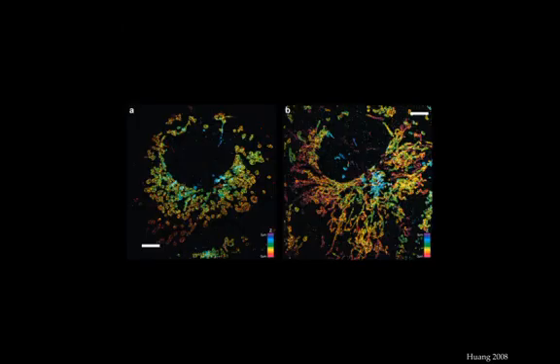Interestingly, they were also able to distinguish cells with overall different mitochondrial morphologies. These probably represent different cell stages. On the right, there's a more elongated tubular network, which is probably associated with interphase. This network breaks apart during mitosis or apoptosis, producing the more globular, blobby mitochondria seen on the left.